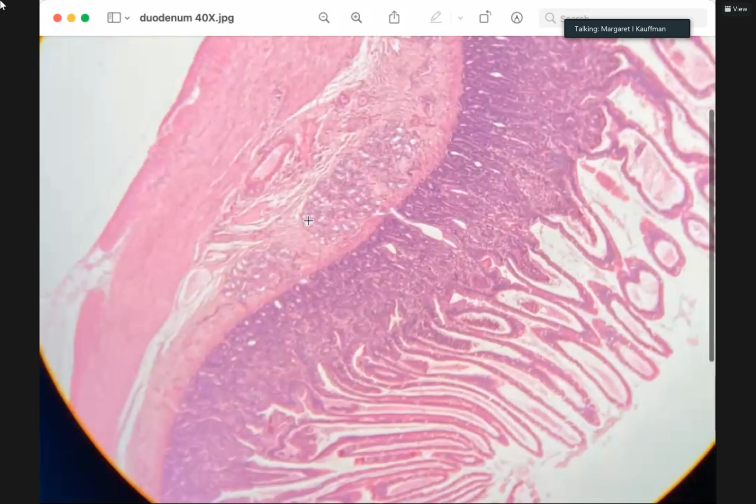Okay, so the duodenal glands are down here in the submucosa. Everything that is pink, dark purple or purpley, all the way up to here, that's all mucosa. Lots of people made this mistake. They were calling this the submucosa. Whereas these are the big villi going all the way down here, and it gets pretty tight down in here, but those are the crypts. These little gaps down in here, those are the crypts. And then you have the muscularis mucosae right here. It just looks brighter pink than the submucosa itself, which is over there.